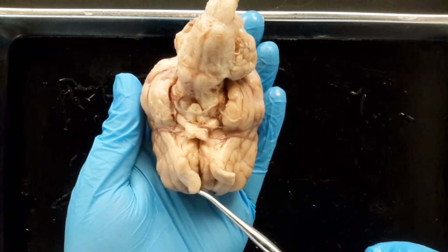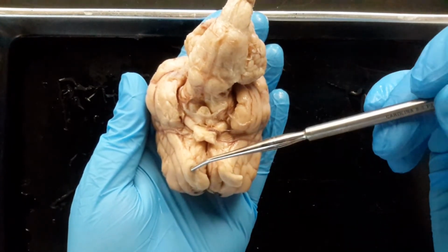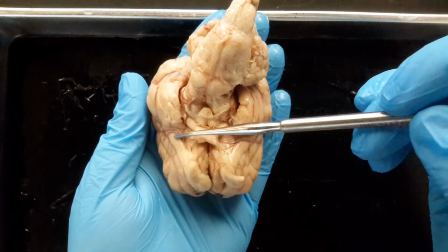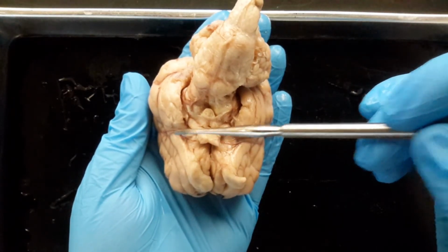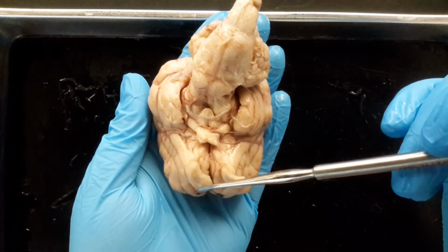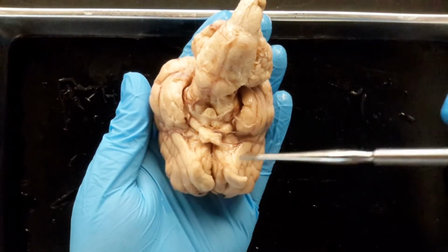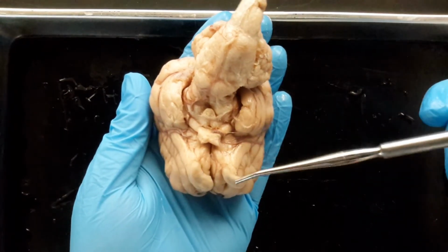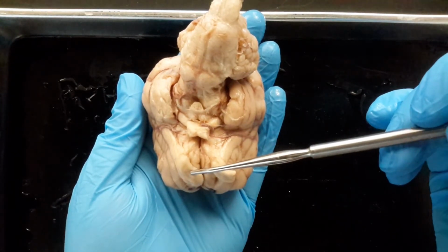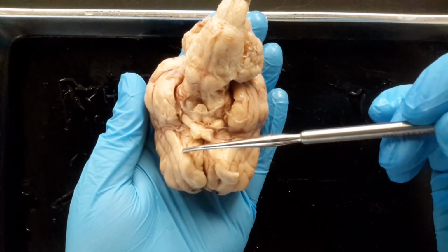It's the enlarged portion here. So this is the olfactory bulb, and then you can follow that white tract of matter. This is the olfactory tract. So the nerve that's carrying all the information from the olfactory bulb, from your nasal cavity, and then the olfactory tract goes back to, I believe, the temporal lobe. Okay, so those are two structures you do need to know. If the pin is here, it's your olfactory bulb. If it's along here, it's the olfactory tract.